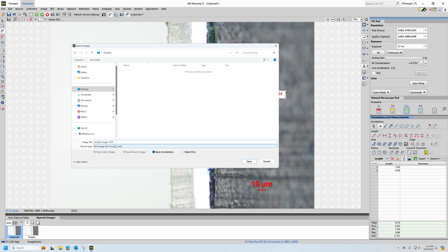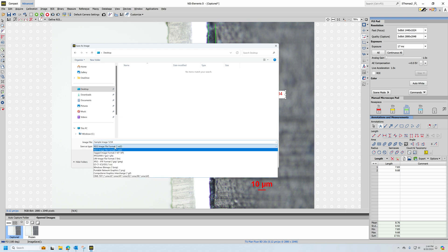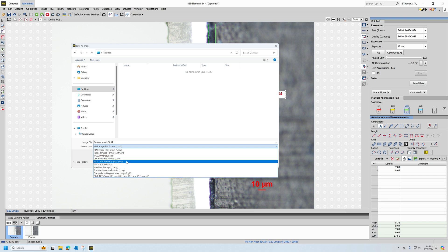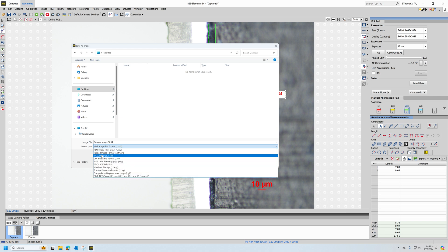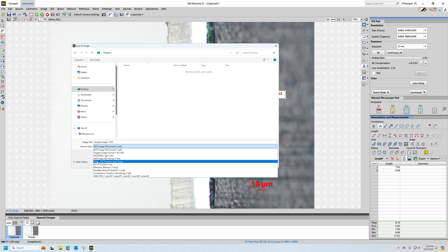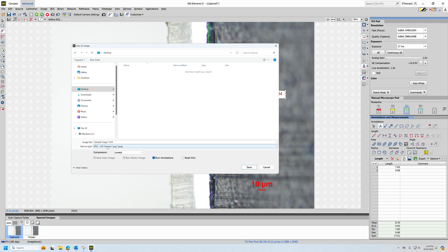I can change the file type from an ND2 to say a JPEG, which is one of the most universally recognized image formats. Whatever image format I pick here, that's what the images will save as until I change this. So if I set it to JPEG and save the image as a JPEG, it's always going to save as a JPEG.